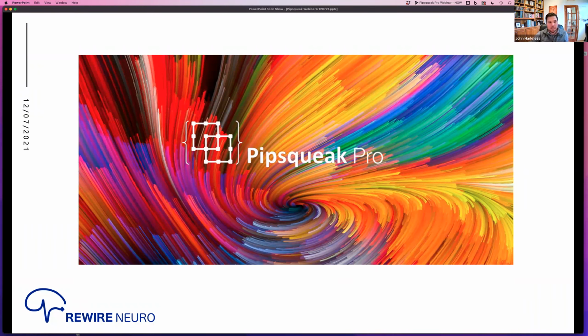Yeah, that's actually a really good segue into what we'll talk about. The very earliest versions of Pipsqueak were using thresholding entirely, and that had some benefits in that it's good at picking up a lot of different cells. But if you have high backgrounds or a lot of white fibers going through your image, it can really fail at finding edges. And so that's where our AI approach came from, and I'll talk about that.